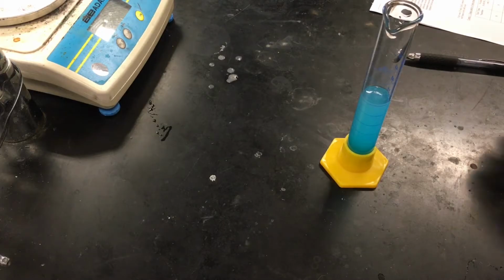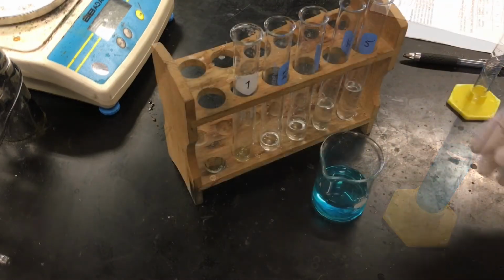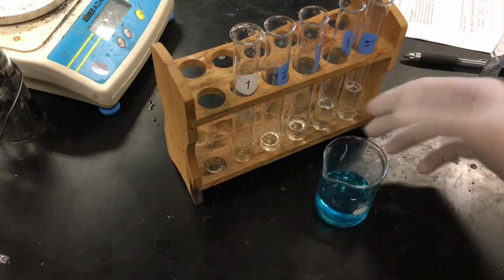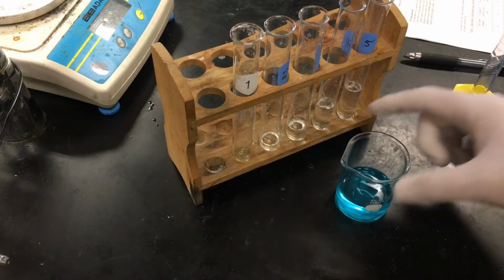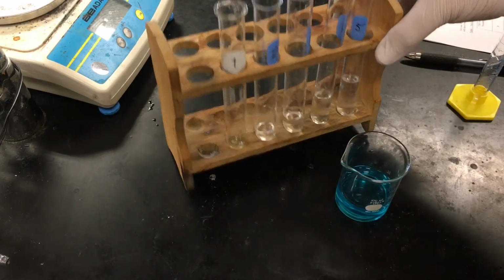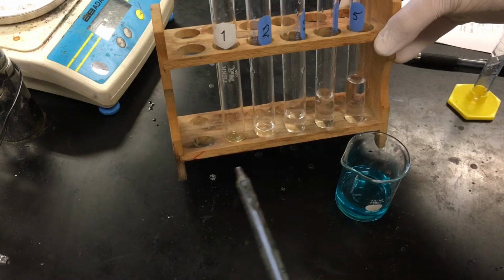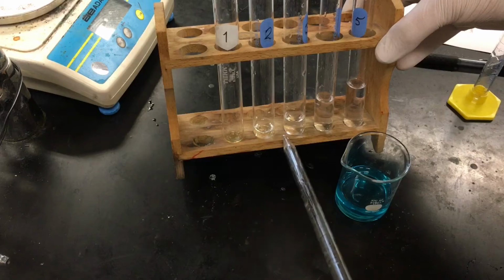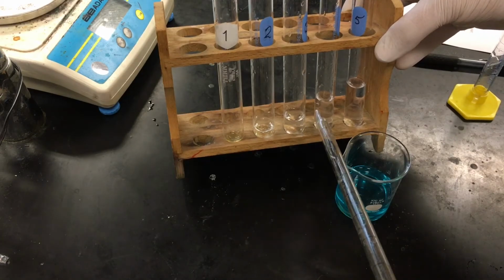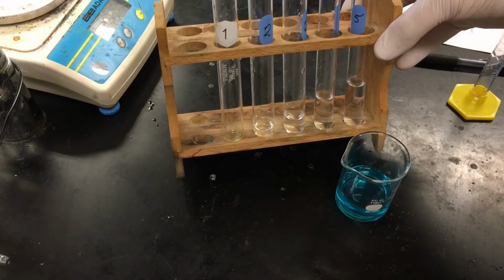It is time to start making our dilutions using our stock solution. So we're ready to go. With the dilutions, we have the 35 milliliters of the copper chloride solution, 0.4 molar. We have 5 labeled test tubes. In the first one, there's no water. Test tube number 2 has 2 milliliters of water. Test tube number 3 has 4. Number 4 has 6. And number 5 has 8 milliliters of water.